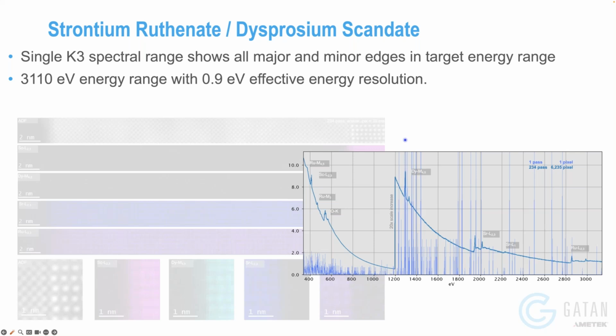But yeah, this presentation does leverage the IS capability of the imaging filters, and in-situ is not just for in-situ; it's also for dose fractionation, which turns out to be equally important. I would just say I almost never don't do this now with any data.